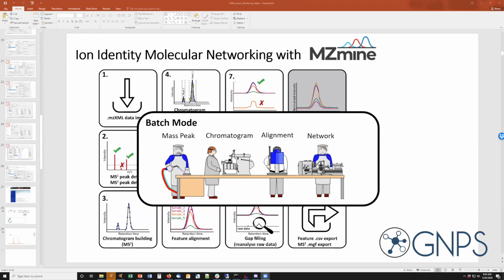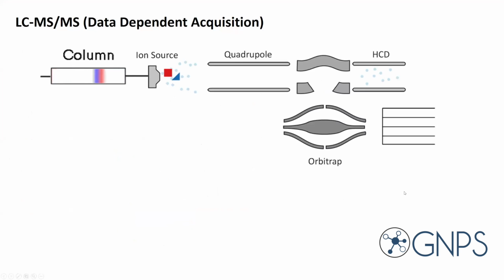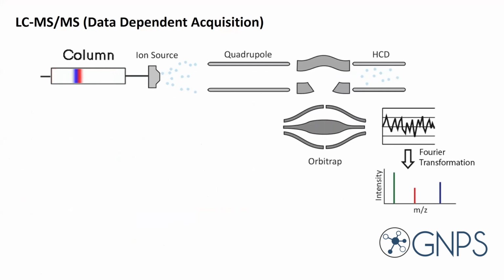Yeah, I just want to recap a little bit what we just did. And I actually want to start here, and that is the data acquisition of the data we were just working with. So we used a UHPLC Q Exactive coupled system where we first separate those compounds and then analyze them by tandem mass spectrometry in an Orbitrap analyzer.